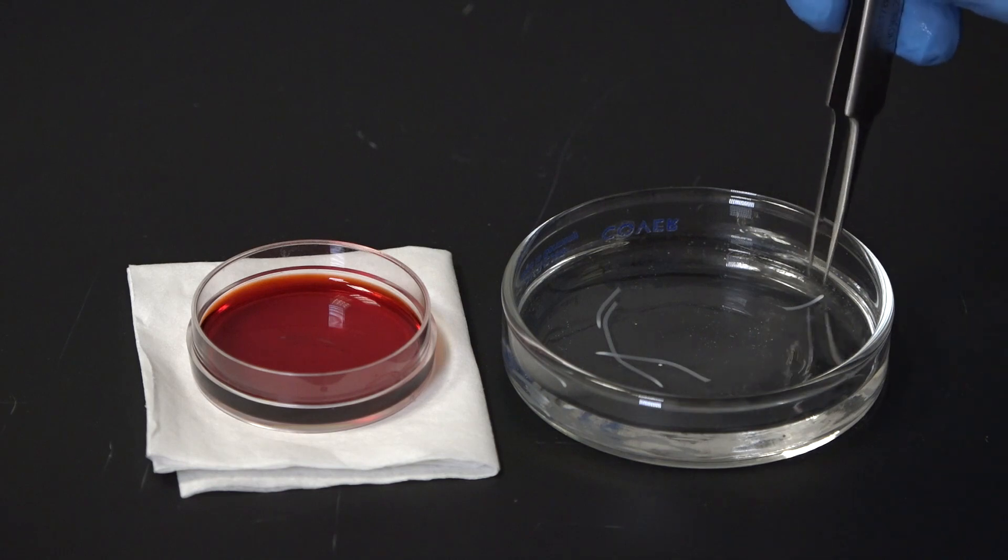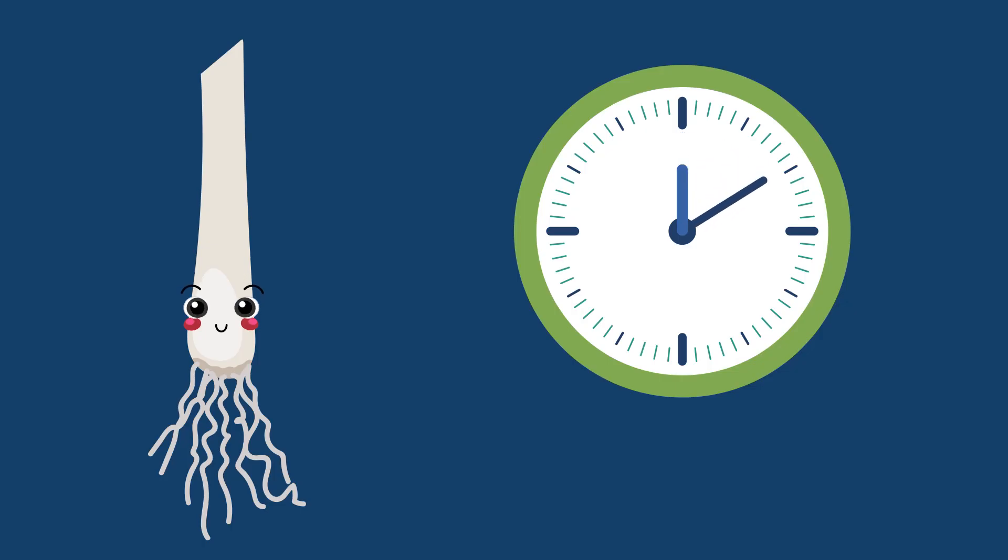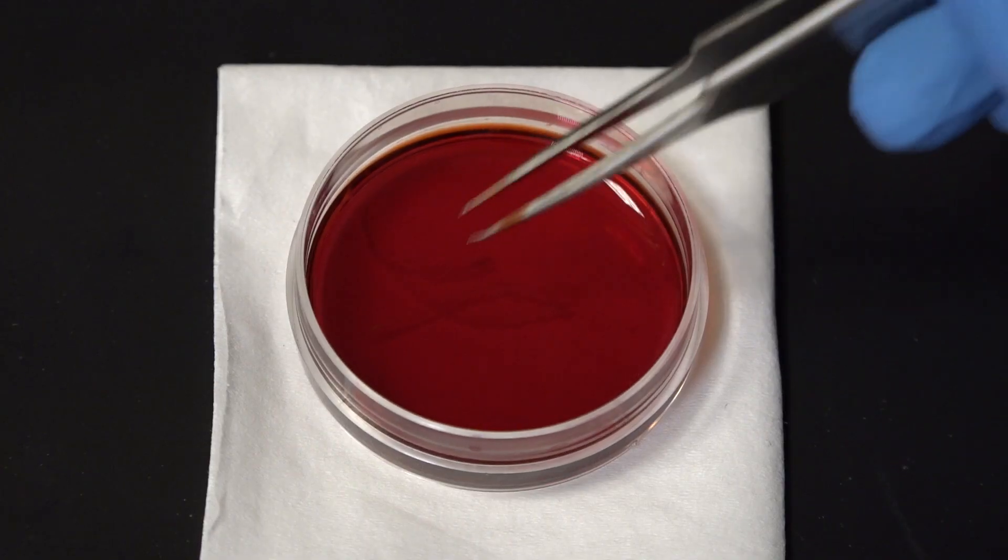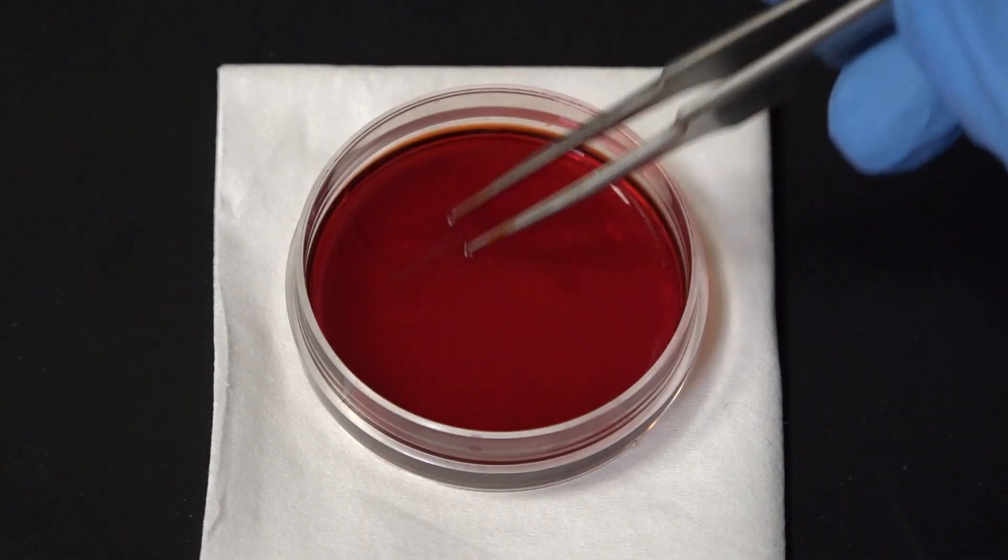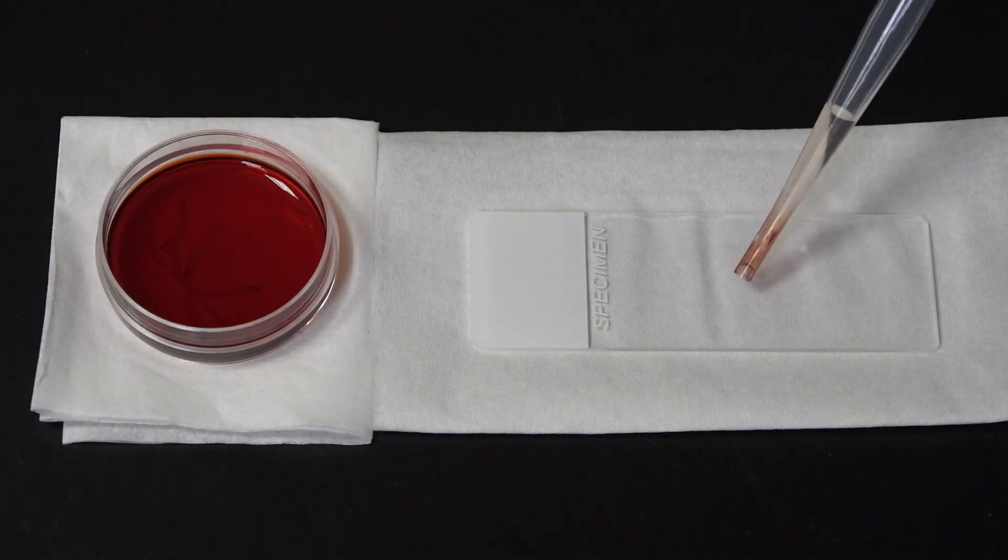Then another move to the dish of acetocarmine where they'll sit for five to ten minutes. This will stain the cell's chromatin red and allow us to see the DNA. But you can use any DNA or chromatin-specific stain for this step. And then it's just one more move to their final resting place.